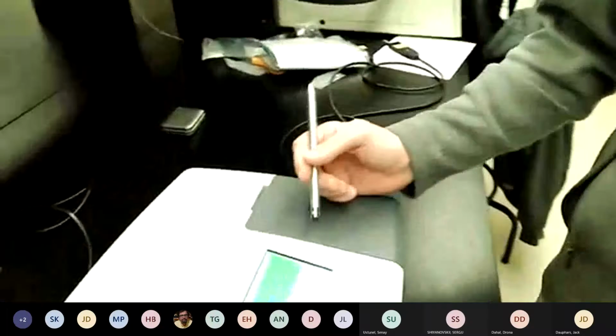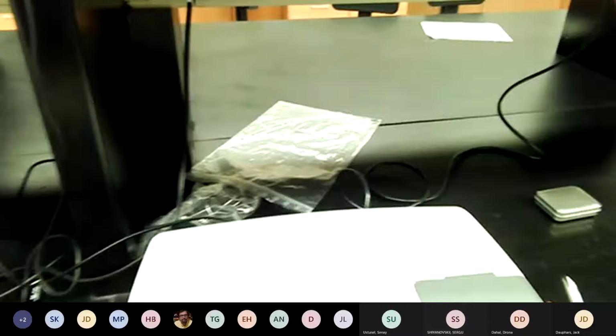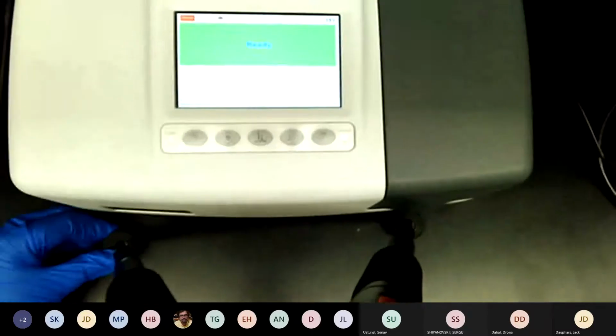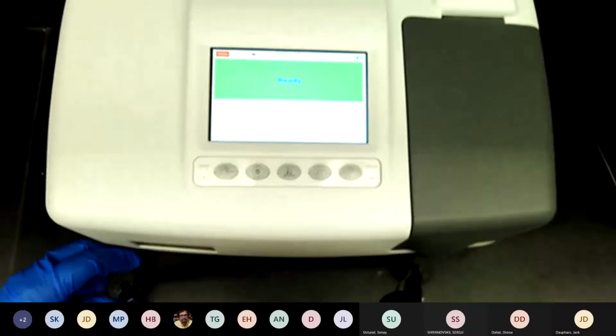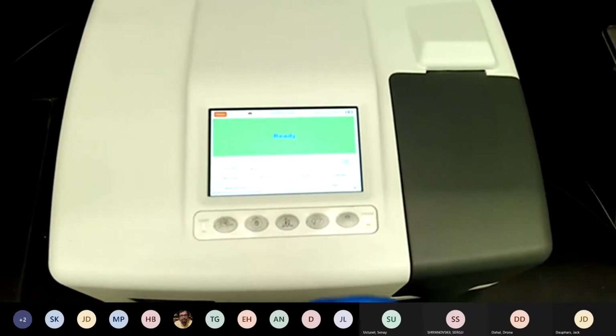Show the screen or... Okay, maybe this way. Oh, what we did just now? Yeah. Can you move it? Yeah, let's back it up a little bit here. Can you just see the screen? Okay. Yeah, that's not very useful, is it? But at least if people see the control pad. Yeah. It cannot go too close. Can you guys see this at all?